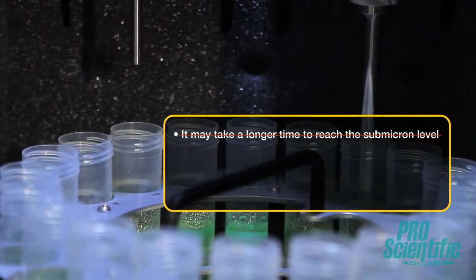However, with mechanical homogenizing alone, it may take a longer time to reach the submicron level. While the downside of sonication alone is that it cannot break down large solids, and often a substantial amount of heat is emitted that can potentially degrade your sample.